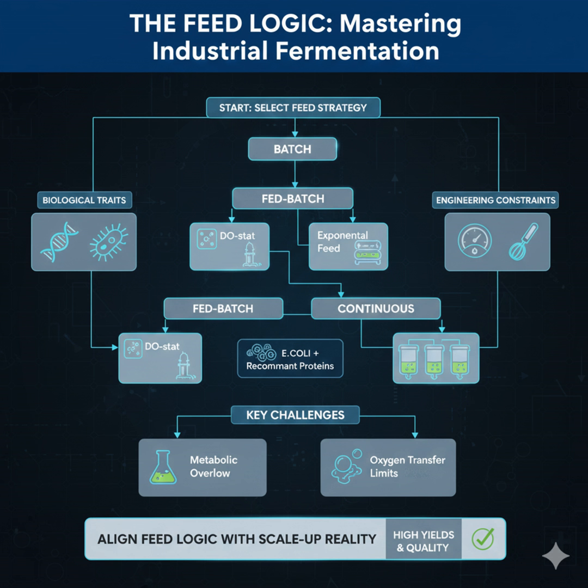Absolutely. You have to implement a tightly glucose-limited fed batch, staying well below the Crabtree effect threshold. And the quality implication here is profound. When the cells are happy and unstressed under that carbon limitation, they produce dramatically lower levels of stress-induced proteases. And those proteases are bad news. They're notorious for clipping and degrading the secreted therapeutic protein product. So the quality-aware strategy leads to higher integrity and higher stability of the final molecule.